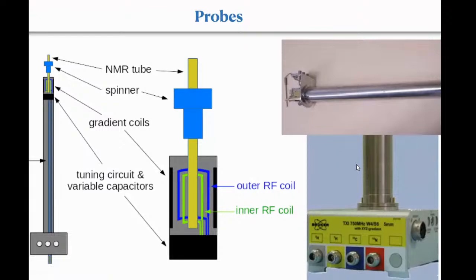Or carbon 13 nuclei. So in organic chemistry or any normal NMR chemistry laboratory, what people teach, what people do is carbon 13 and proton NMR. Proton normally has a high sensitivity. Why? Because I told you the M0 depends on the gyromagnetic ratio. Gyromagnetic ratio is really high, right? And its abundance is really high. So you don't have to have so much sensitivity for your protons. But on the other hand, carbon 13 is not the natural isotope. That is only 1% of the total carbons in your sample. So 1%, and also the gyromagnetic ratio is 1/4 of proton. So your sensitivity is reduced already by 1/4 because of the gyromagnetic ratio. And on top of that, you're losing signal because there is no 100%. You have only 1% of carbon 13. So you want as much sensitivity for your carbon 13 compared to your proton.